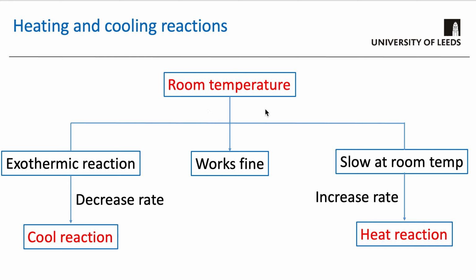If, for example, we have a reaction or a chemical process that's slow, then what we want to do is heat the reaction, and by heating the reaction, we're increasing the rate of the reaction. We're giving the molecules greater energy, so when they collide together, they're more likely to have enough energy to get over the barrier to forming a new bond. That's the key reason why we heat reactions, and that's why we're asking you to heat a reaction using a technique called reflux to make paracetamol.